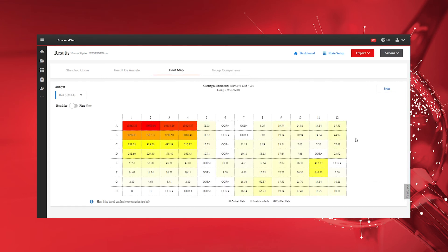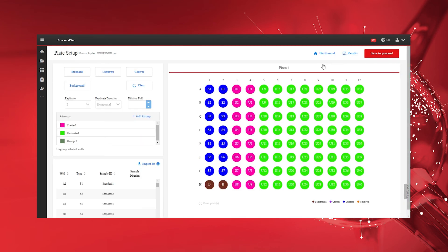Use the Plate Setup button on top to navigate back to the Plate Setup page and modify the plate layout when needed.